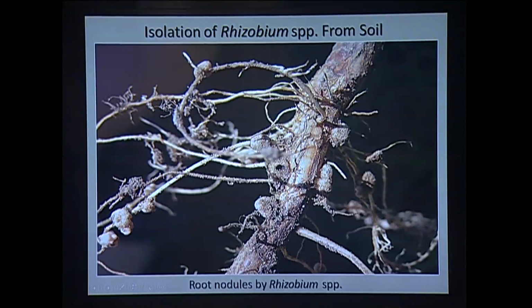Because the nodules are very specifically housing the Rhizobium within themselves. While if you take soil from around this region, it will also have other contaminating microorganisms. So you will have to eliminate the contaminating microorganisms, probably go for several rounds of pure culturing, while in the nodules it's only the Rhizobium. So isolation and identification both become very, very easy.